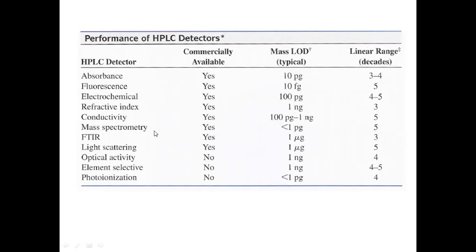And particularly during the online characterization process, we can use mass spectrometric detectors where an ionization chamber will be utilized in order to perform the ionization process or fragmentation process for the given molecule. Once the solutes undergo fragmentation, the m/z values of the obtained ions will be recorded by means of these mass spectrometric detectors, and hence the characterization will become very simple.